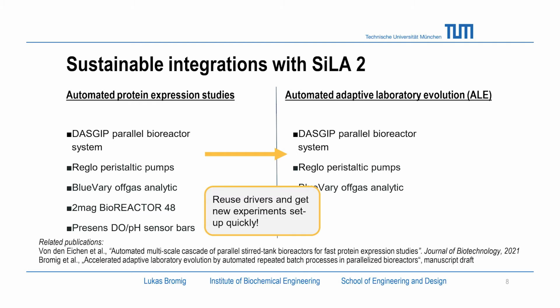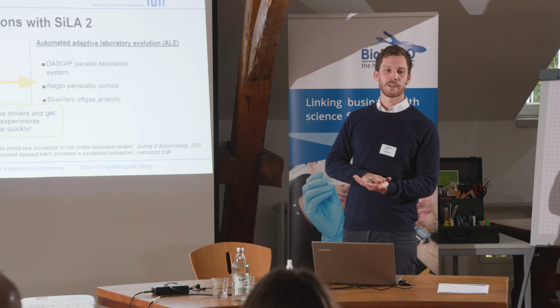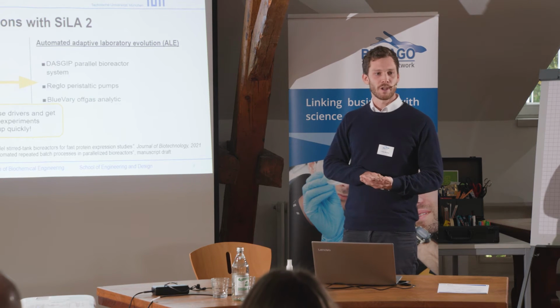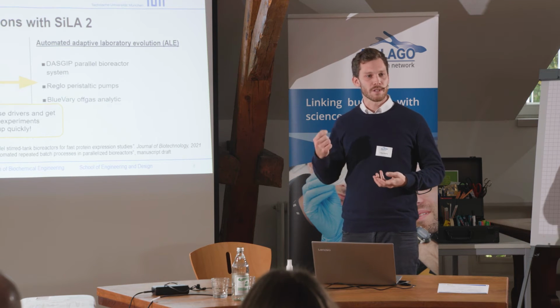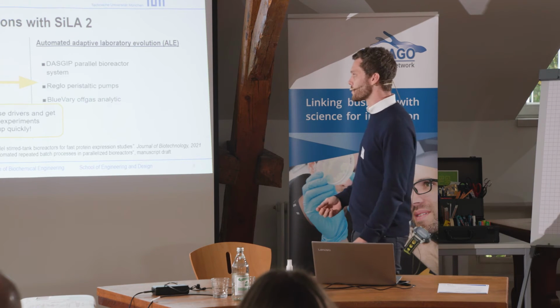So we could recycle our SiLA driver for the DASGIP parallel bioreactor system. We could recycle the peristaltic pump drivers. So we didn't have to spend money on a second integration again. So if we had, in the first place, made some sort of custom solution that somehow integrated the DASGIP with the Venus from the Hamilton pipetting robot, we would not have been able to just switch and move things around as easily as we are now with SiLA.